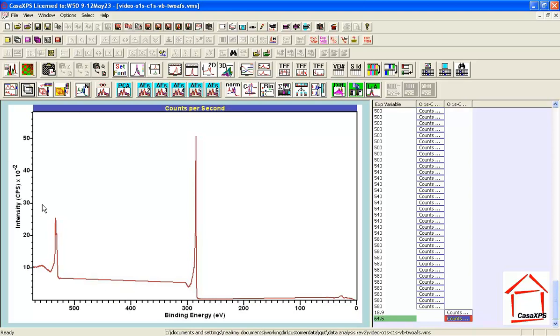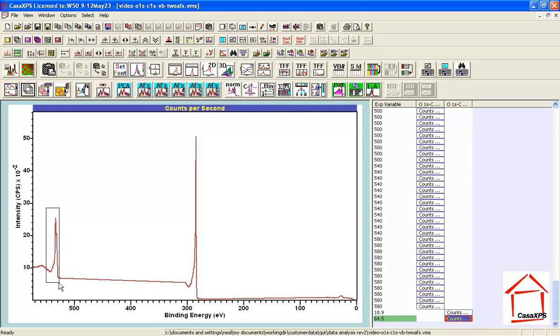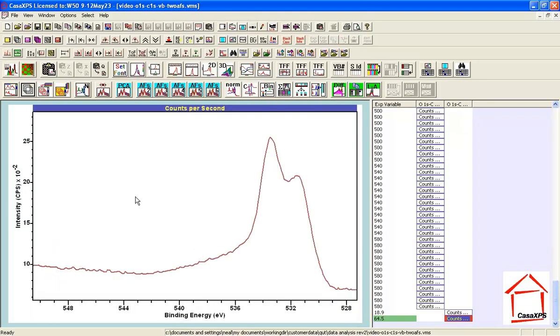Looking at the carbon, it has a similar sort of shape, giving confidence that loss peaks need to be accounted for. The Carbon 1S has complex structure — there could be asymmetry in the primary carbon peak and unknown complexity in the oxides involved. I'm therefore shying away from the Carbon 1S and focusing on the Oxygen 1S. There's enough signal around the photoemission peaks to suggest I can construct a peak model accounting for these complex shapes using a component that isn't a bell-shaped curve.